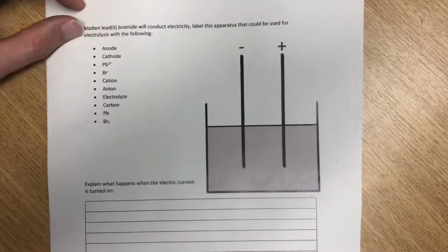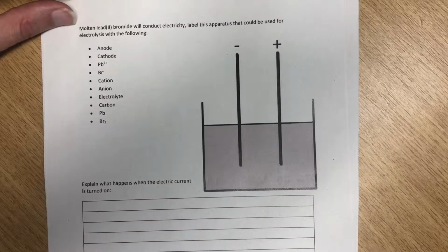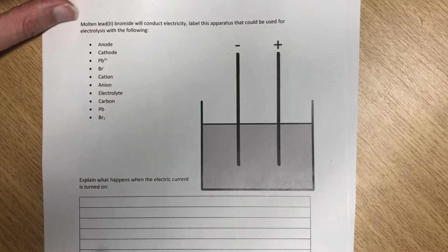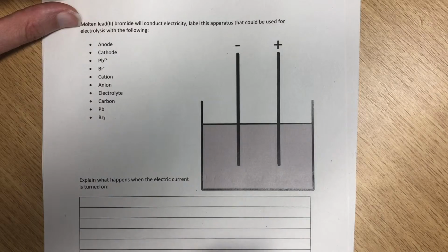So, a nice simple example of electrolysis now. Molten lead bromide will conduct electricity. So we've taken the lead bromide that was solid and we've made it a liquid by heating it.